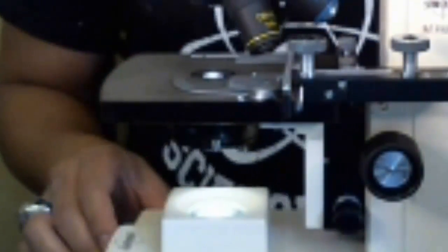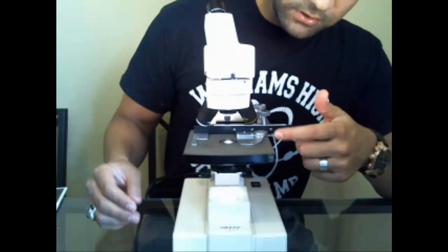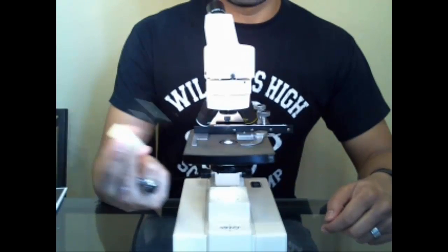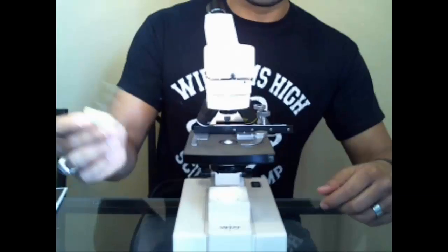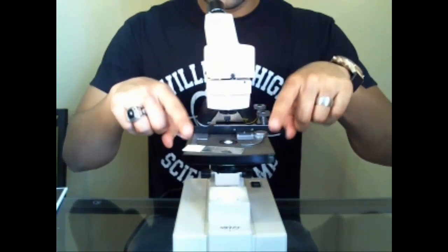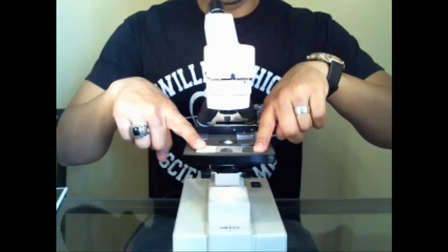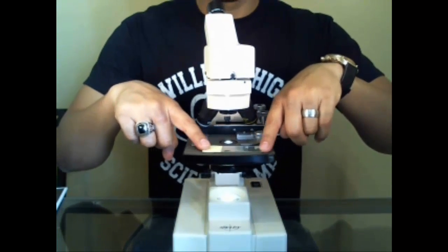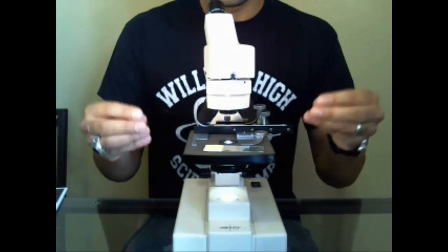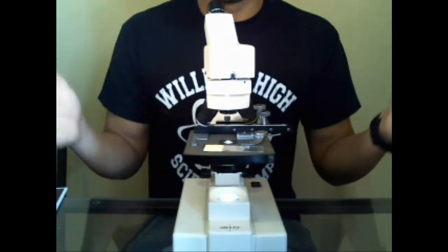So we have the stage, the diaphragm underneath, and on the stage itself is where you put your slide. This model has mechanical pieces to make it easier. There's a little hook — if this were an older model, you'd have little stage clips that hook onto each side to hold it still, and you'd have to manually push it around with your fingers. The slightest nudge would knock it completely out of your field of view.